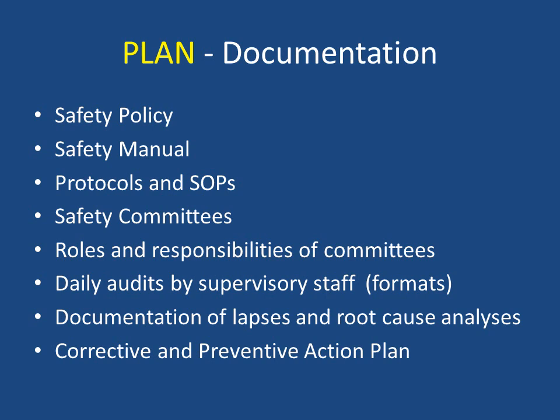Write up standard operating procedures and protocols and plan formats for documentation. Appoint a safety committee. There should be one at the management level and one at the laboratory level. The roles and responsibilities of the safety committee should be defined.